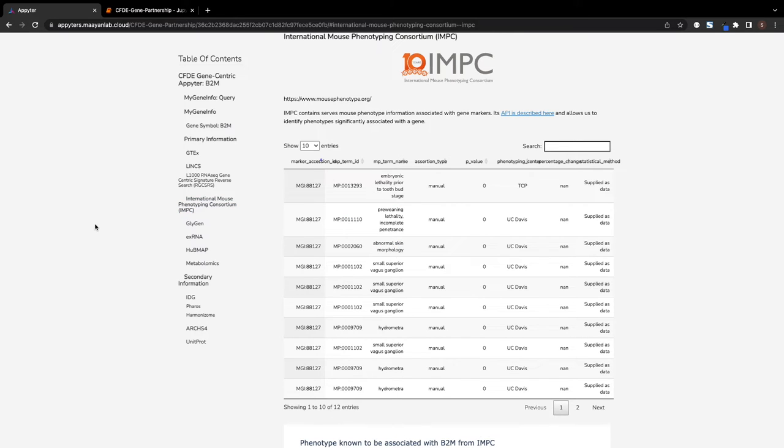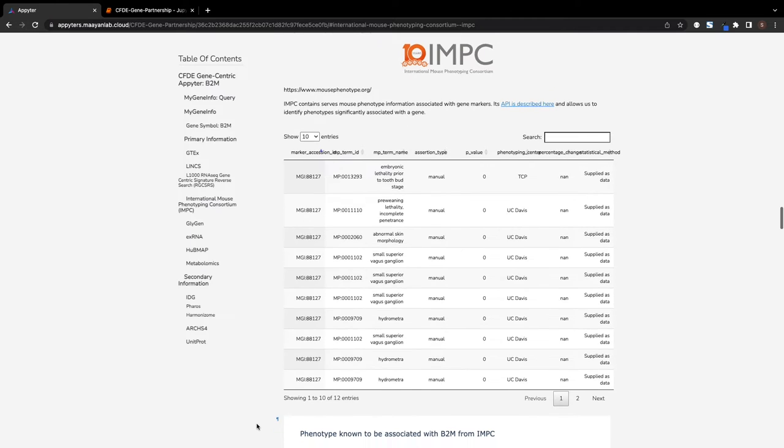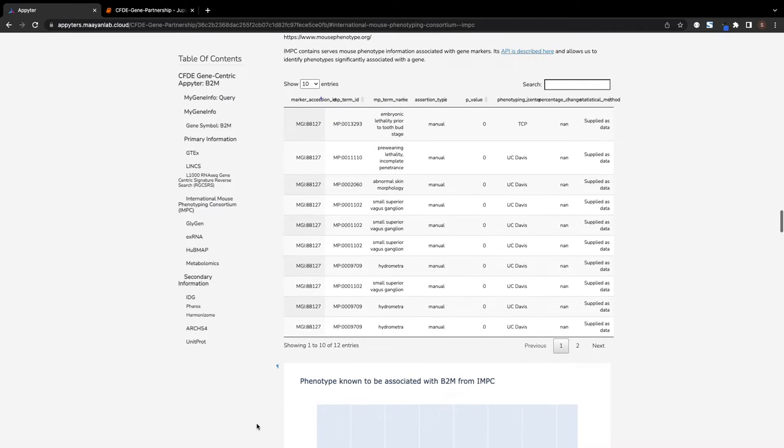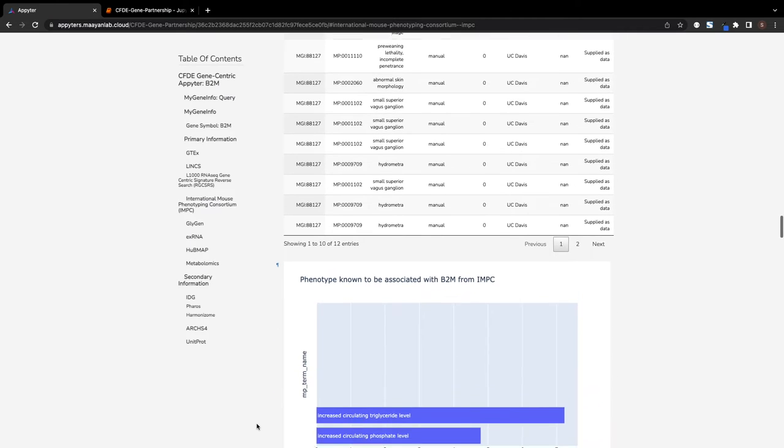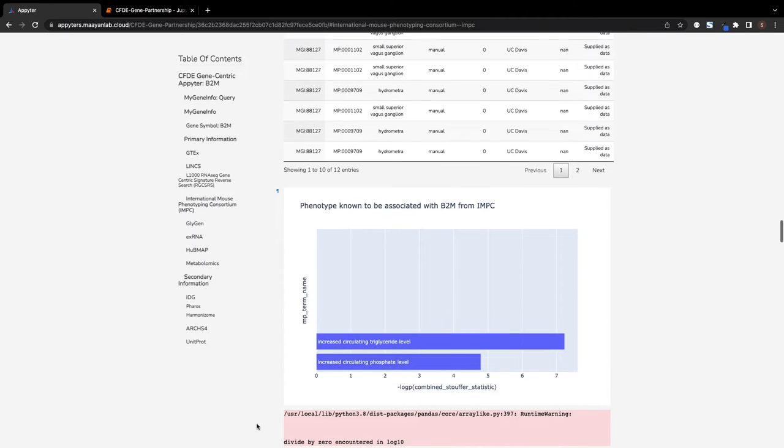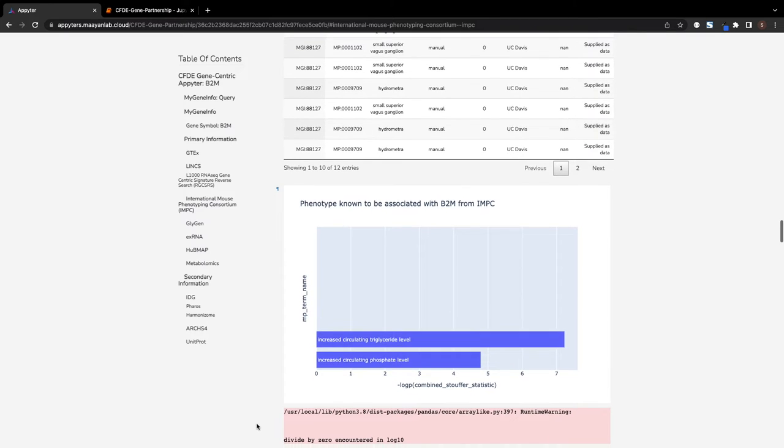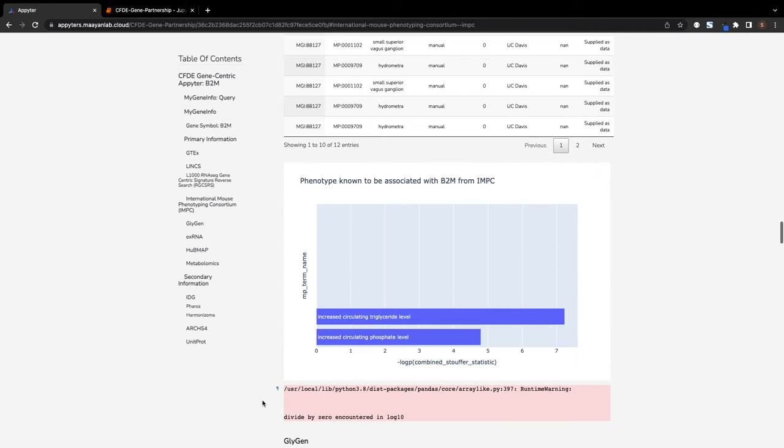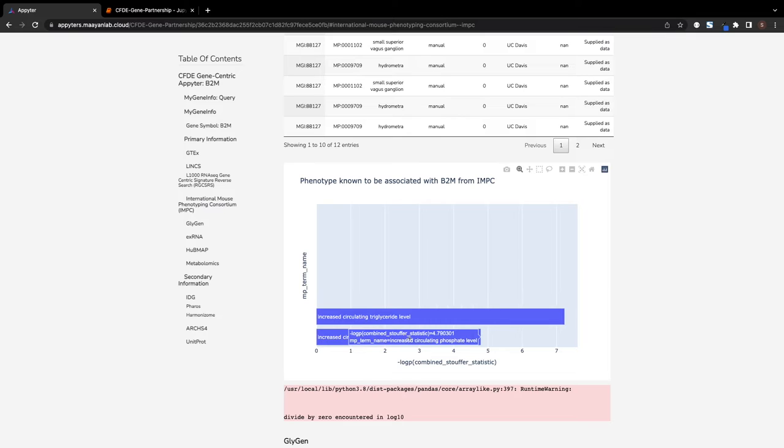While the Appyter focuses mainly on human genes, the International Mouse Phenotyping Consortium API is called to provide additional knowledge about mouse phenotypes observed when the gene is knocked out in a mouse, which could provide further insight into the function of the gene.